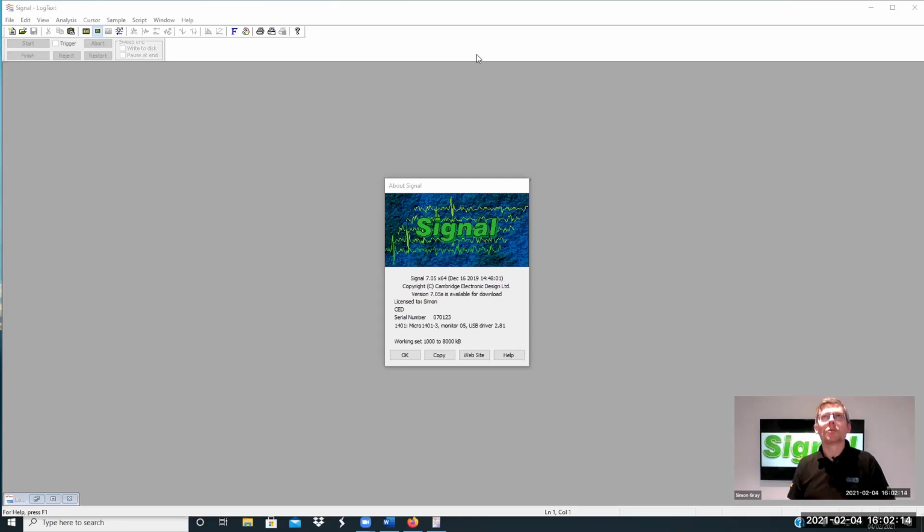Okay, when we think about a waveform crossing, this could be, say, a heel strike on a force plate. Just as many labs use Spike 2 for analysis only, just as many use Signal, and therefore we allow many different types of file to be imported. Some of those would include the ABF and DAT file types from Axon Molecular Devices or Heka.